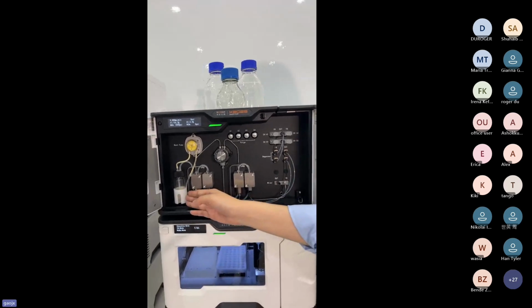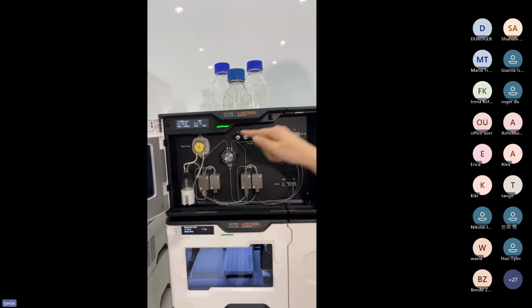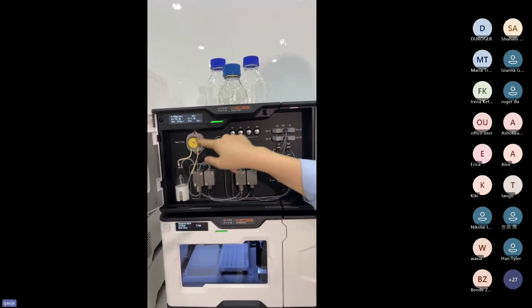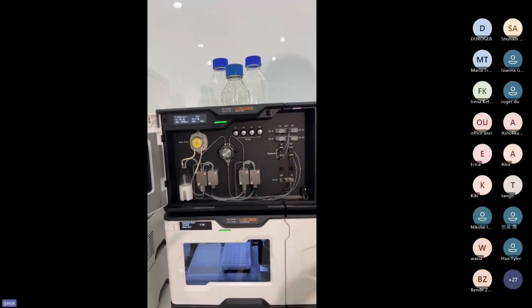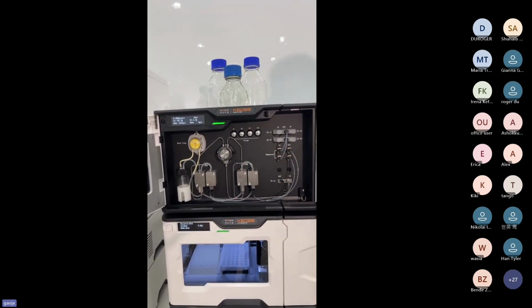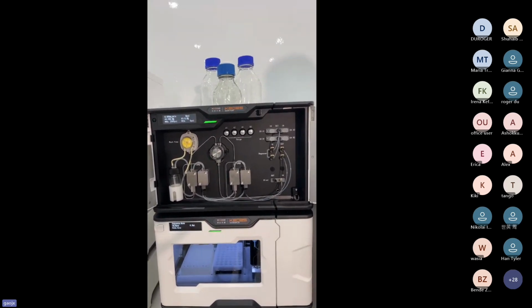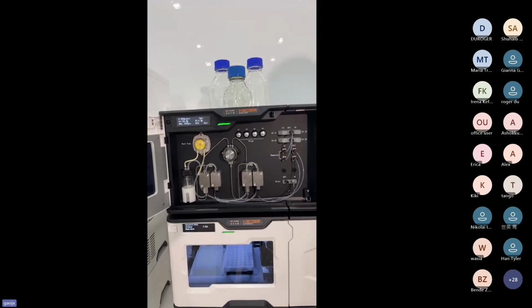This small bottle contains the solvent for plunger rinsing. During the operation of the pump, the wash pump automatically turns on and operates periodically to rinse the plunger and plunger seal without any additional settings. This effectively prevents damage to the plunger and seal due to crystallization of buffer salts and makes the pump more durable.